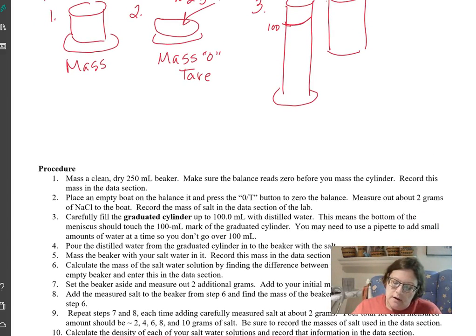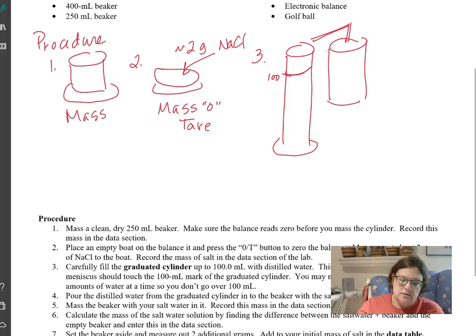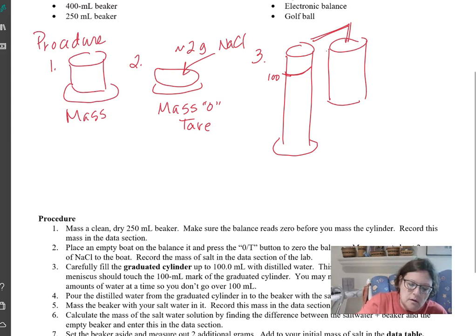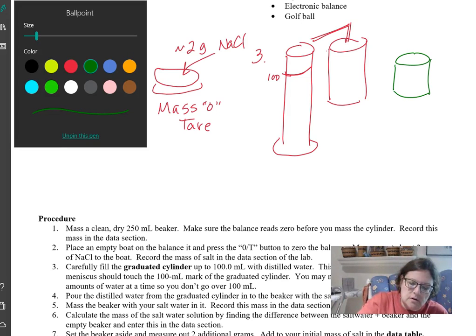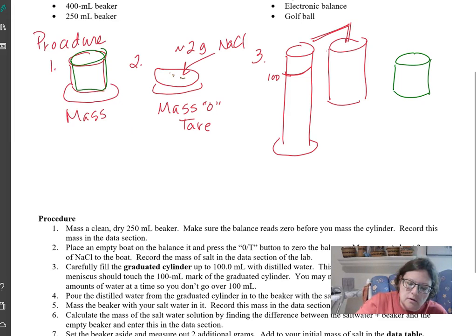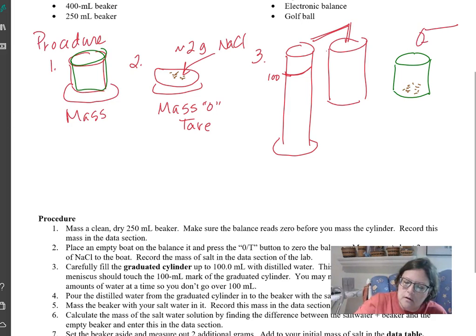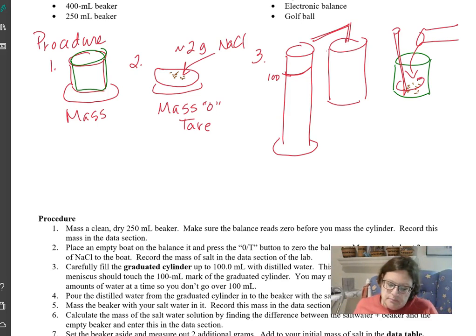Pour the distilled water into the beaker with salt. All right, so we're going to take our beaker from step 1, we're going to take our salt from step 2, and then we're going to pour our liquid in there, and we'll stir it with a stirring rod. Okay?